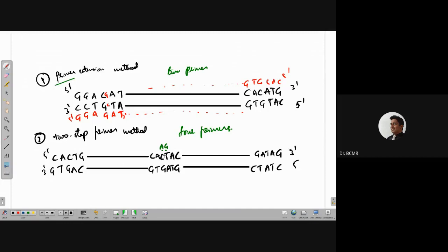I will also write here what I'm expecting. In this location, I'm expecting A, and in this position, G. So the primers, I will only write for the ones that incorporate the mutation. So one of it would be G, sorry. G, T. So one second, I have to also mention what is expected here. C and, sorry. It is T is expected here and C is expected here. Upon mutation, that is the sequence that is expected. So it should be G, T, T, C, T, G. So if I'm using this, this would be the 5' of it, 3'.